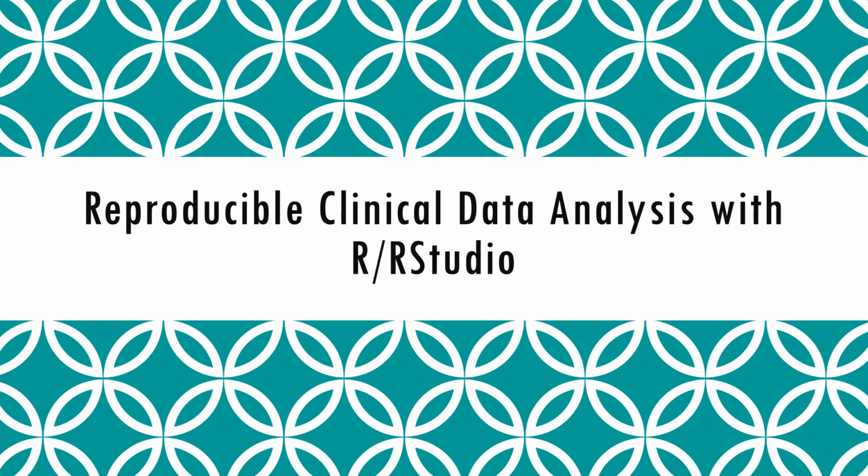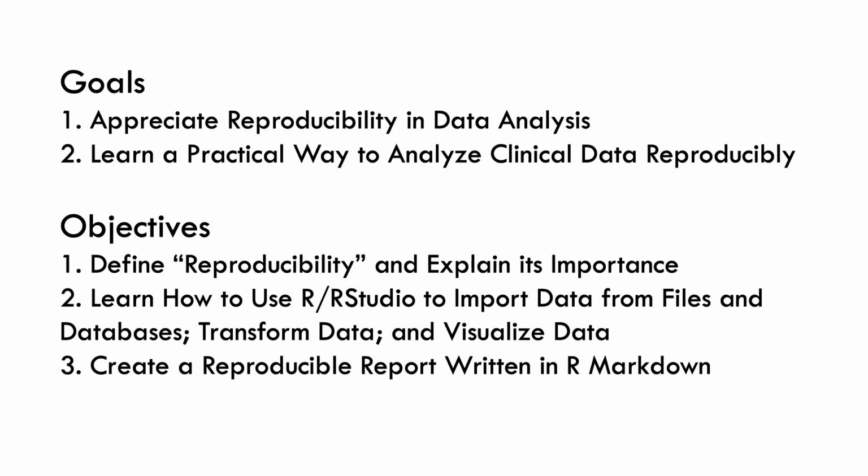and who are familiar with Excel for doing this, but want to learn a more efficient way that's also less prone to errors. So here are the stated goals of the course: to better appreciate reproducibility in data analysis and to learn a practical way to analyze clinical data reproducibly. And by the end of the course, participants should be able to define reproducibility, and they should gain confidence in their ability to use R and RStudio to import data from files, transform data, and visualize it, and be able to create a simple reproducible report or computational document written in R Markdown.